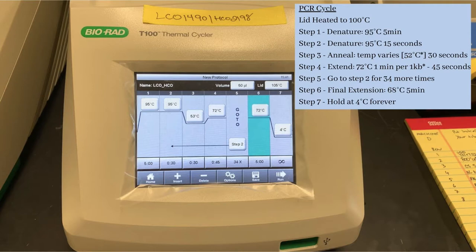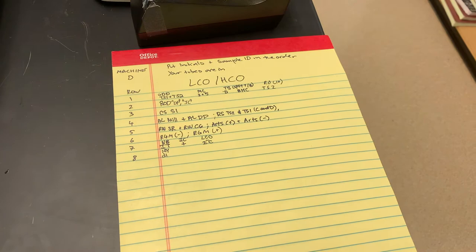We were sure to note where we put our PCR tubes in the machine to ensure that we were able to retrieve our samples once the process was complete.